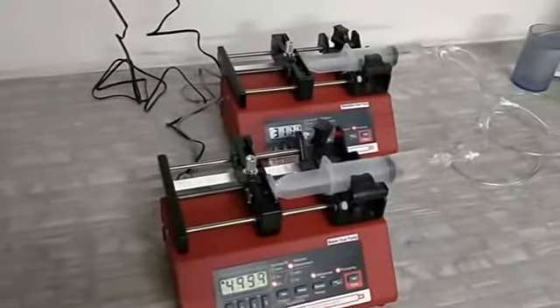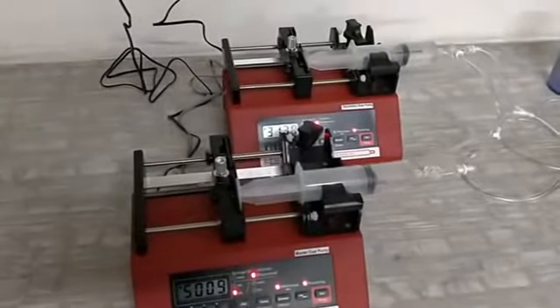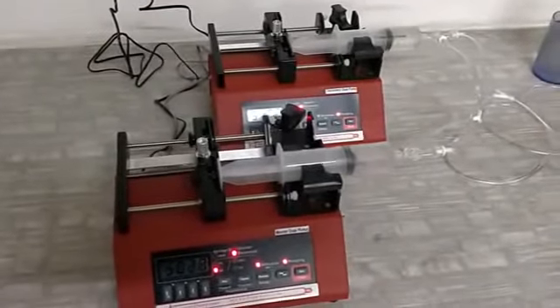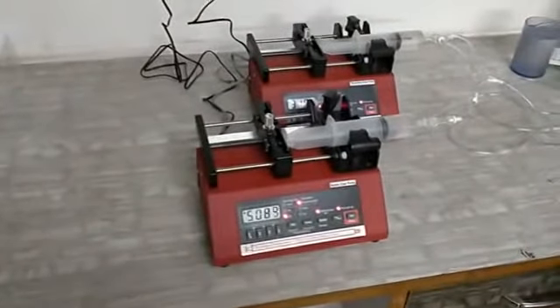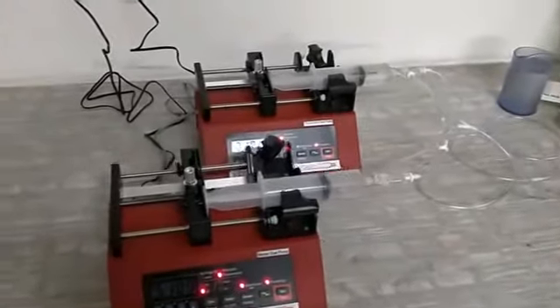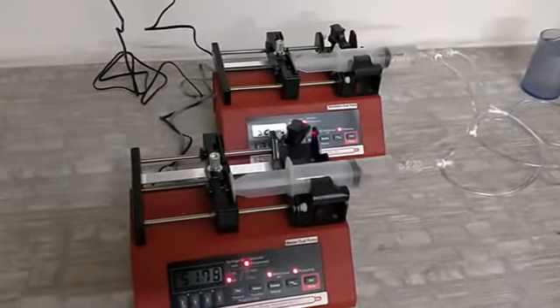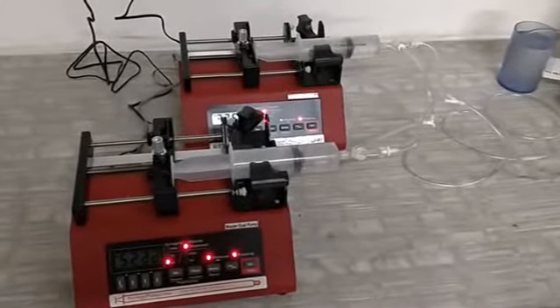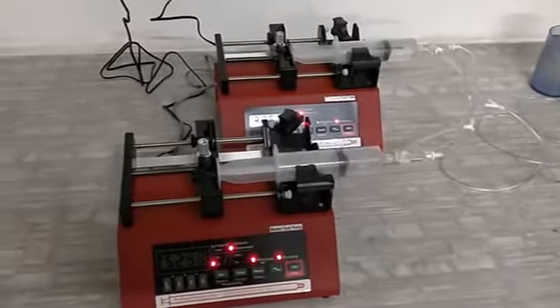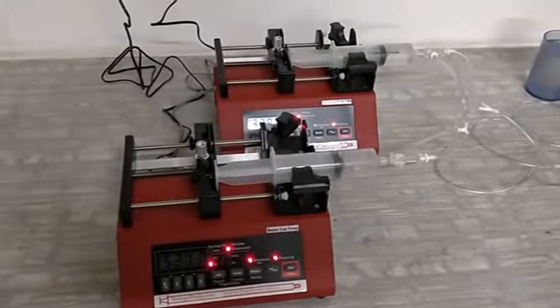Dear customer, we thank you for purchasing the dual mode NE 4000X syringe pump from Unigenetics. In the earlier video, we have shown how this pump works separately, but in this video we are trying to explain how, if you use two NE 4000X units, they can work in the continuous mode.